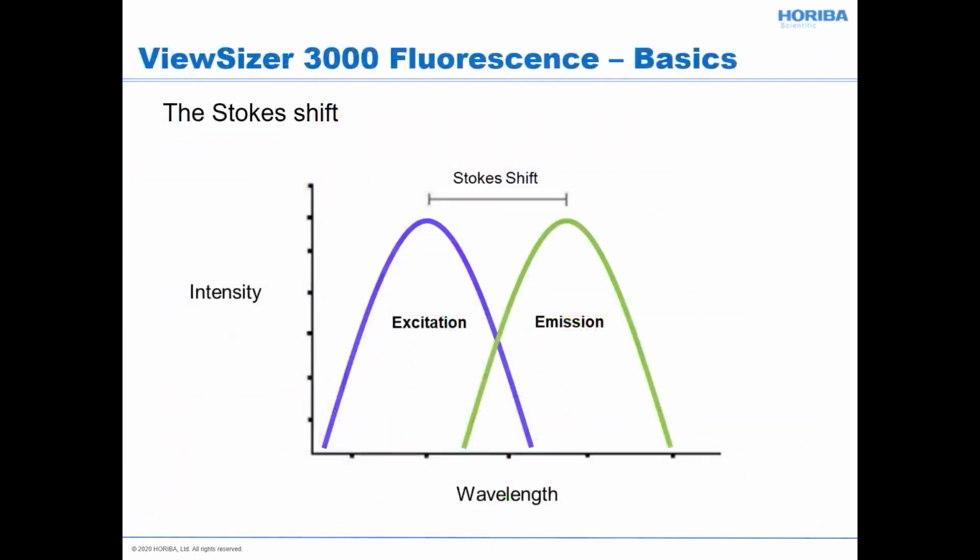So far I've talked about scattering, where light comes in and the particle scatters light. It's coherent and it's the same wavelength as the incoming light. There is another optical phenomenon that you'll stumble across, particularly since HORIBA has a very large spectroscopy division, and one of those is devoted to fluorescence. If we excite the particle with some shorter wavelength, let's say in the blue, we'll see emission at some longer wavelength. That change is known as the Stokes shift.